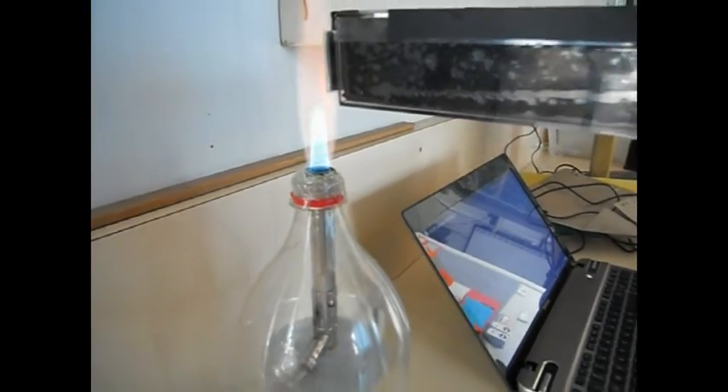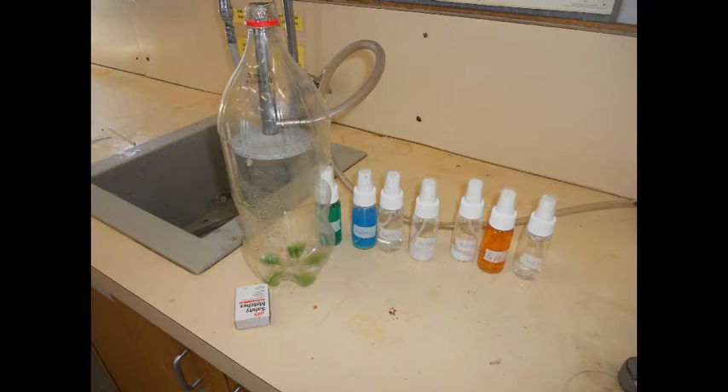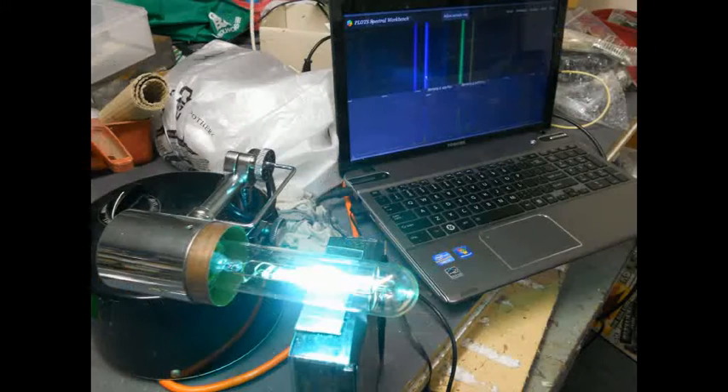We got really good lines from iron nitrate, calcium nitrate, and barium nitrate, and unfortunately we couldn't get our hands on some strontium nitrate. We've also experimented with some discharge tubes — sodium, mercury, and neon — and found some fantastic lines.